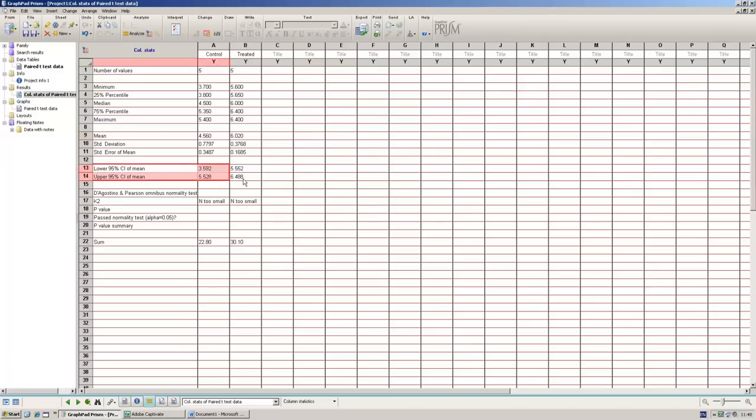So these are similar in a way to the reference ranges and how they're calculated. I'll be wary of taking these as read, because off the top of my head I think Prism uses standard error rather than standard deviation to calculate confidence intervals. The other section here was our D'Agostino and Pearson test, which is testing for normal distribution.